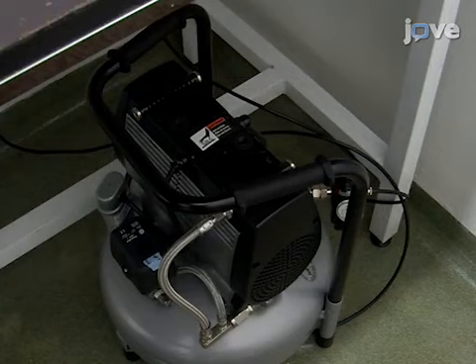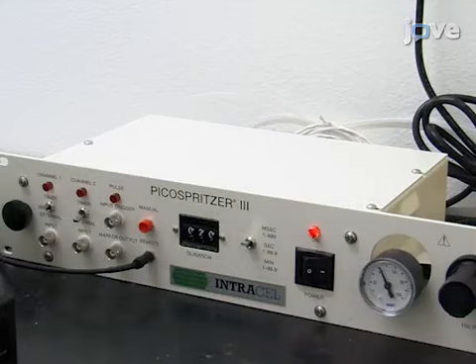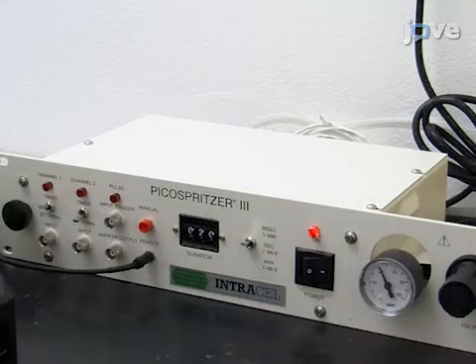To perform zebrafish injections of fluorescent dye, use a standard micro injection setup consisting of an air compressor connected to a pressure regulator system that feeds into a straight pipette holder for use with 1.0 outer diameter capillaries.